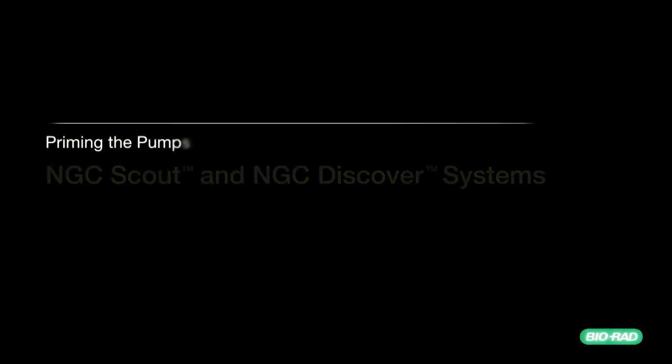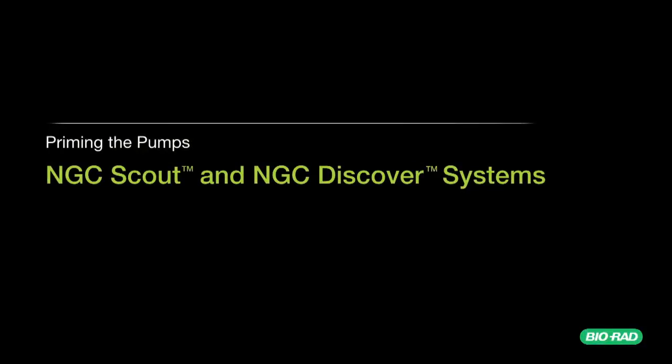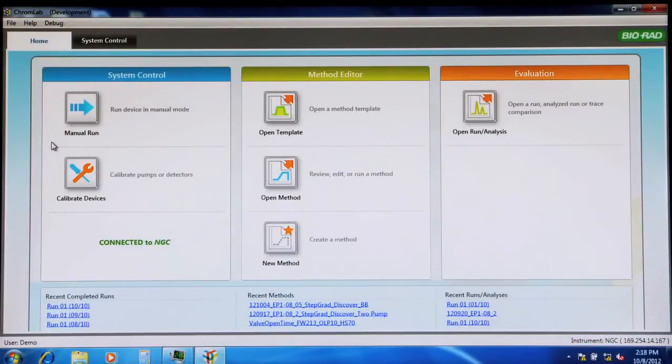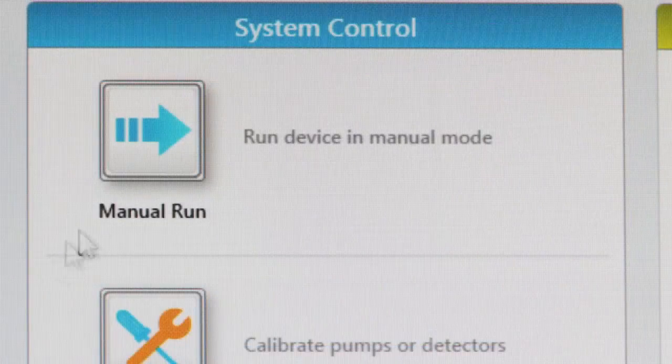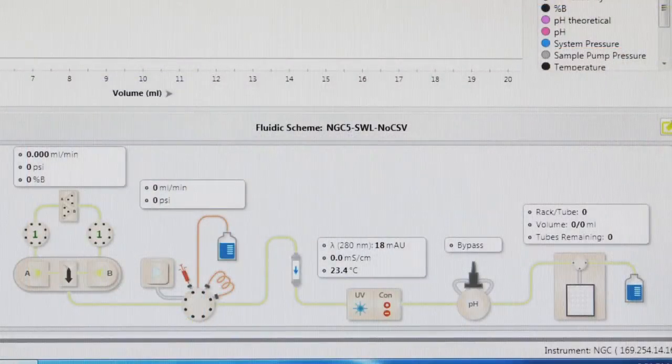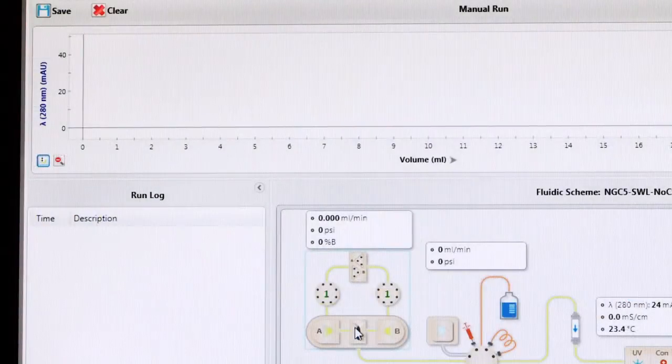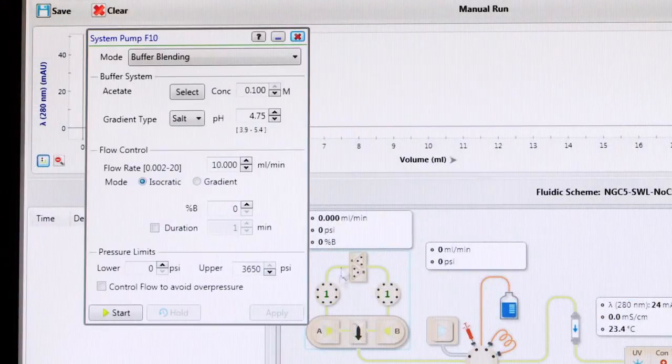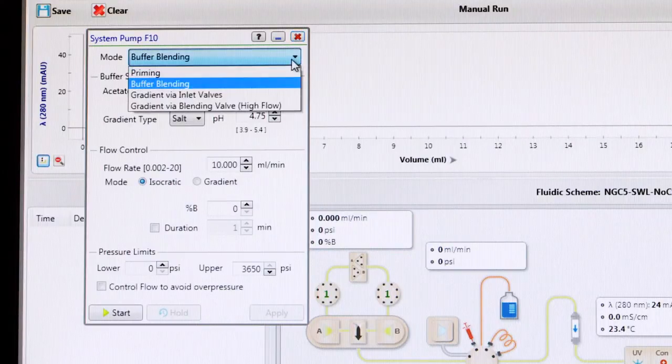NGC Scout and Discover systems. Launch ChromeLab software and connect to the NGC instrument. In the home screen, select Manual Run. The correct configuration should appear in the fluidic scheme shown. Double-click the pump icon. The faceplate appears on the screen.